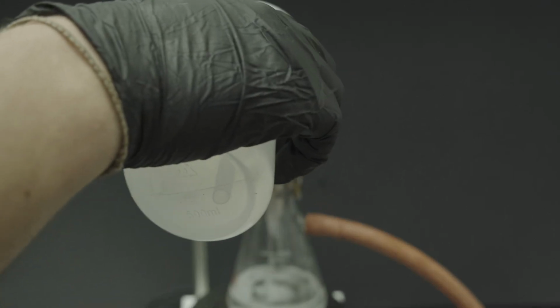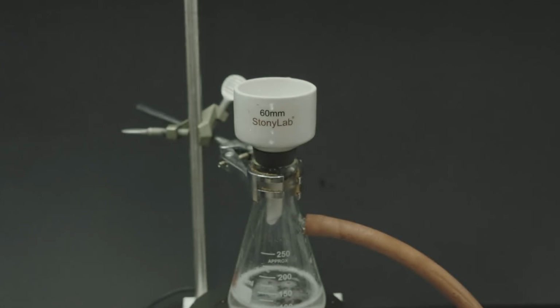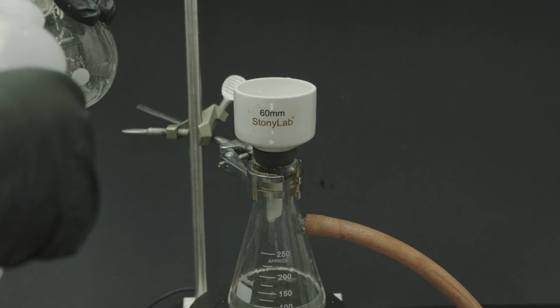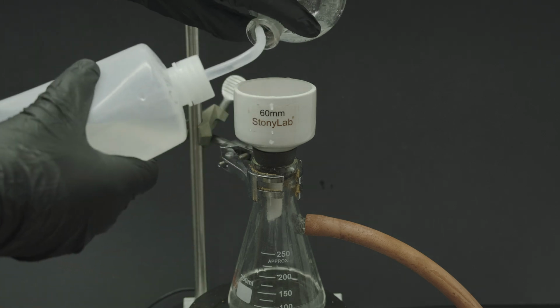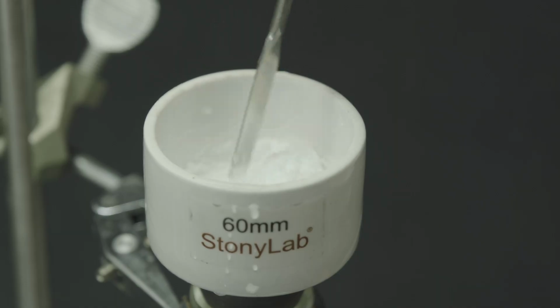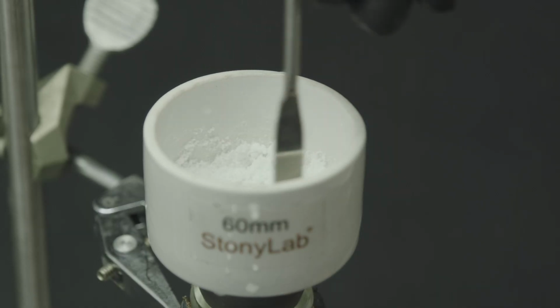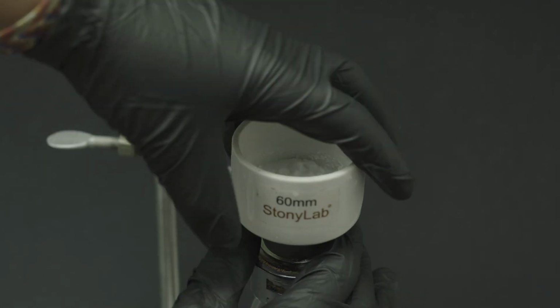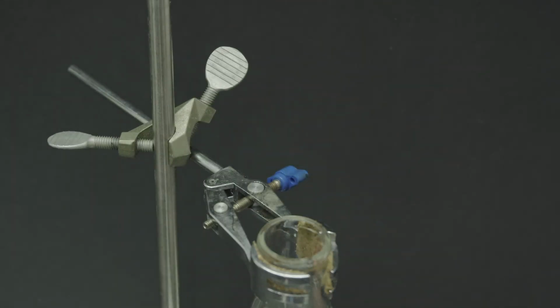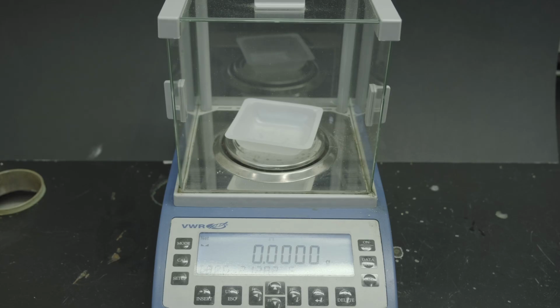I gave my nice white powder a good wash with some DI water just to dissolve any acetic acid that might be there, as well as I gave the flask one more wash, and then all I had to do after this was just let my nice white powder dry. I took my filter and I decided to dump all my white powder directly onto a scale because I was anxious to see what kind of yield I got.